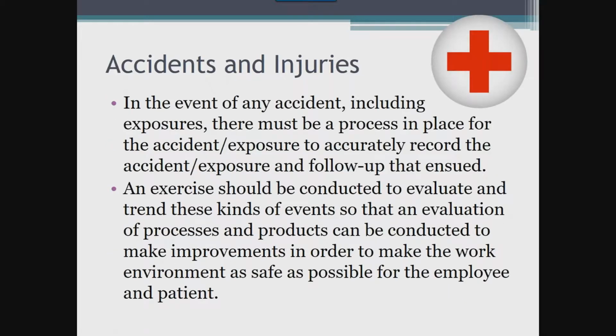We talked about accidents and injuries as related to chemical injury earlier in this presentation. In all aspects of these sorts of events, I mentioned reporting immediately to laboratory leadership. This is such a critical step and often one that is skipped because staff don't feel like they need to, they don't feel like they have time, they forget to, and then don't address it when they remember. They don't feel like the injury or accident was significant enough to report.